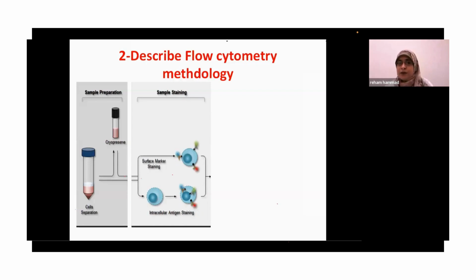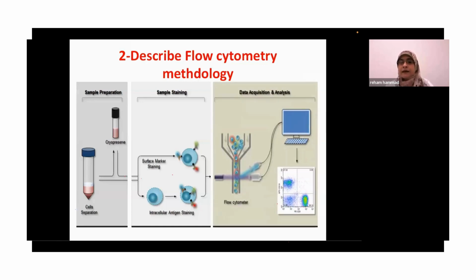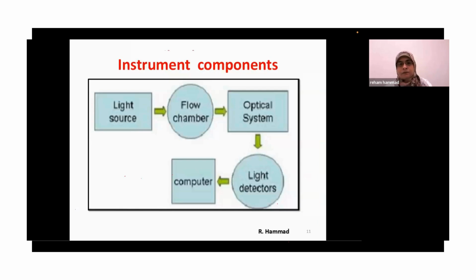As we are in the setting of leukemia, most of the cells we are talking about are going to be the myeloid and the lymphoid precursors, and we don't tackle so much the RBCs and the platelets. Then I will lyse the RBCs and the platelets, get rid of them to make sure that I am only getting the cells that I want, in my case the myeloid and the lymphoid series. And then it is going to be acquired on the flow cytometer, and I will analyze the data.